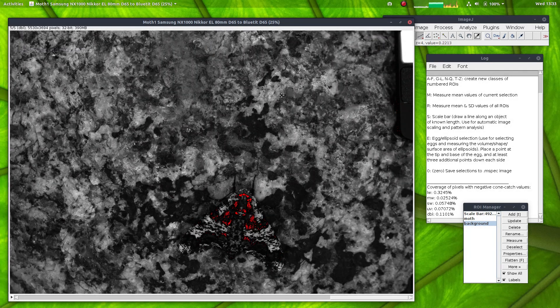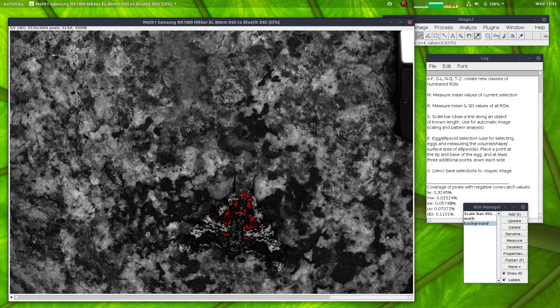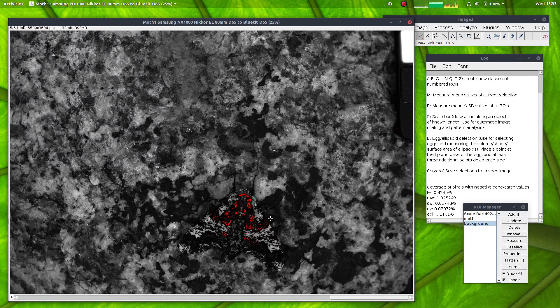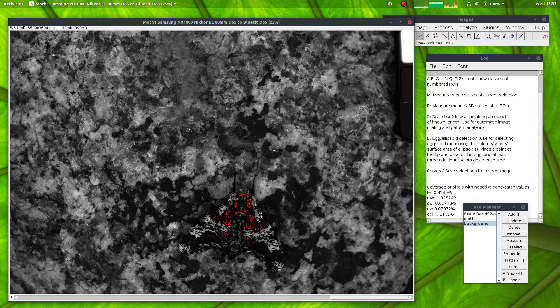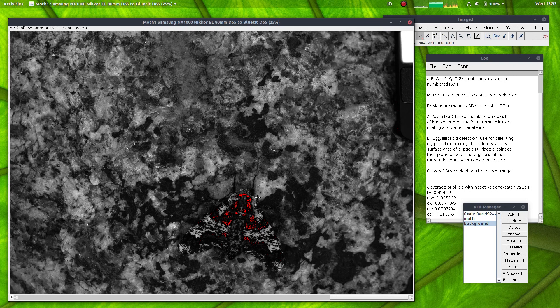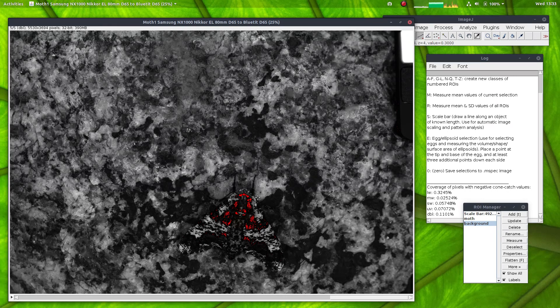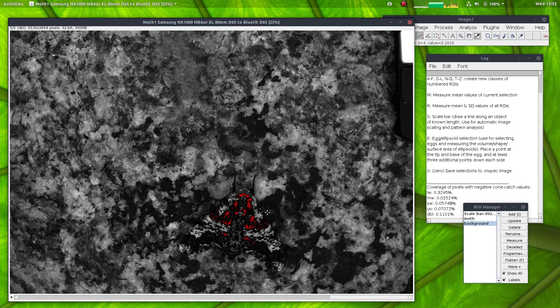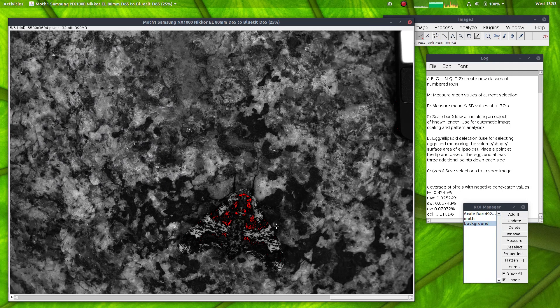So these are the double cones and the QCPA framework always requires, whether it's a dye, tri or tetrachromat image, it requires the last slice in the stack to be the luminance channel. And in this case we're using blue tit vision and their double cones are thought to be their luminance system, so that's perfect.